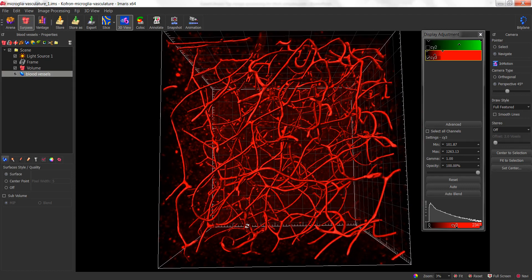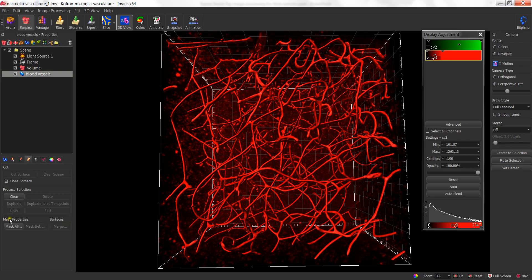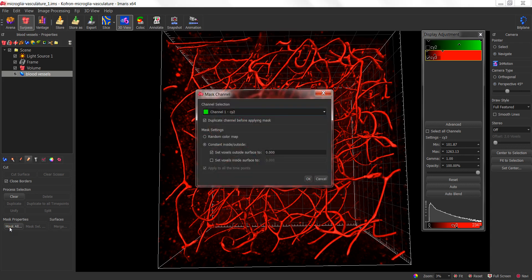Once you've created a surface object, the next thing we're going to do is take advantage of the masking capability. In the surface object, go to the edit tab. In that edit tab, there is a mask function at the bottom. If I click on that, it opens up a dialog that requests we choose the channel we want to apply this to.